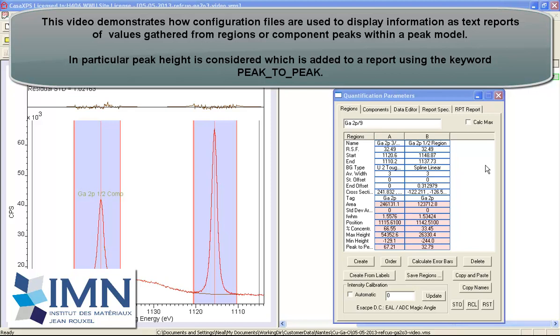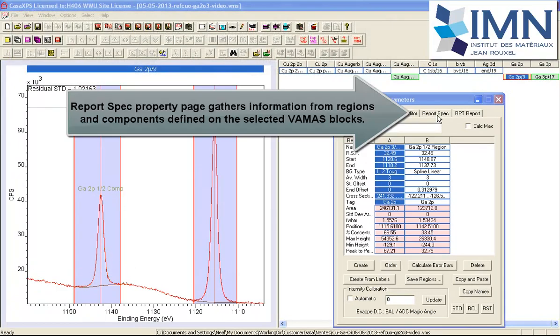In this video we'll look at how the ReportSpec page gathers information from regions and components and creates a text report from spectra.